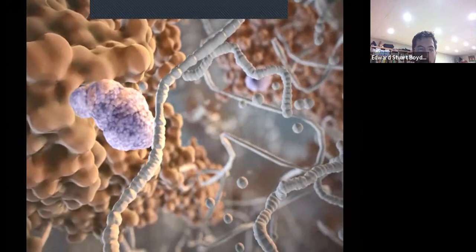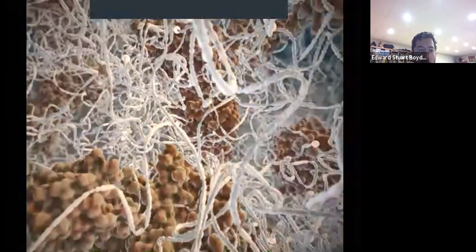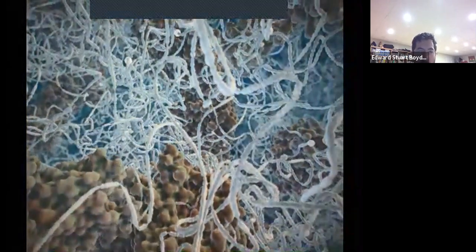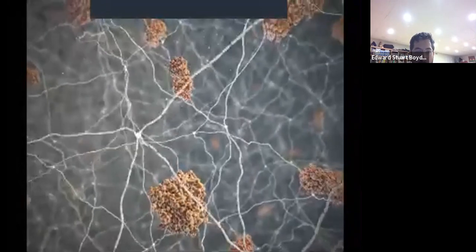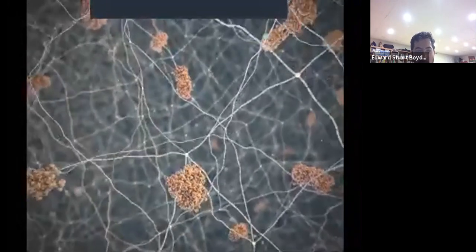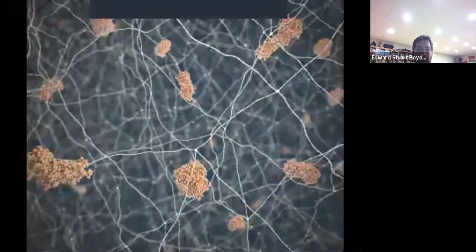In the next step, we soften the tissue or cells. We add enzymes, detergents, heat, and we loosen up all the molecules from each other or even destroy ones we don't want. Then we add water and the polymer, sodium polyacrylate, basically the same stuff as in baby diapers, swells. But because of the handles, the biomolecules get pulled apart. We call this expansion microscopy.